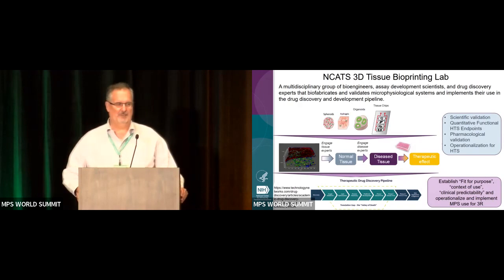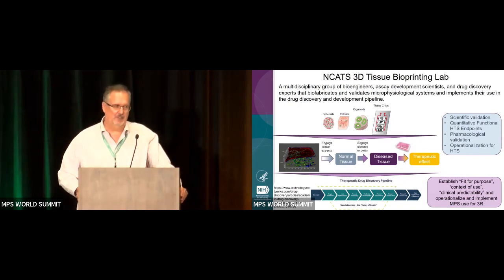As the name indicates, we started historically using bioprinting methods, but in the last few years, we've been expanding to other MPS platforms, including spheroids and tissue chips. And today I'm going to give you some examples of the work that we're doing in this regard.